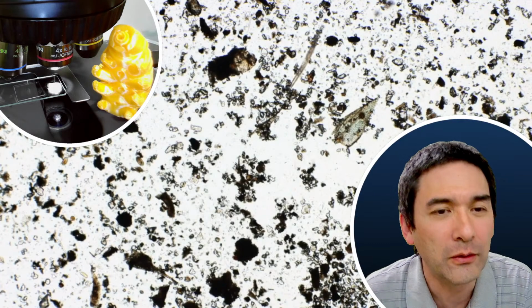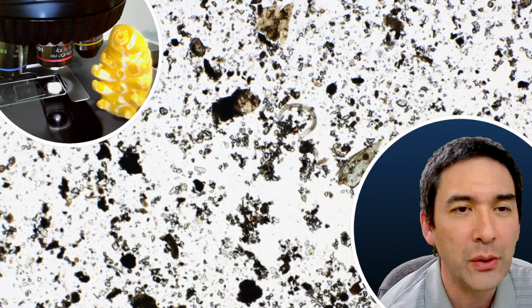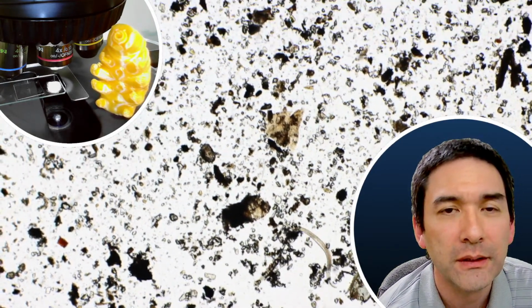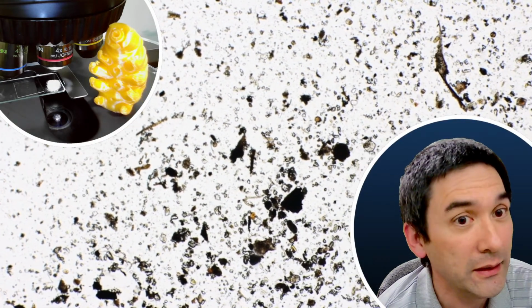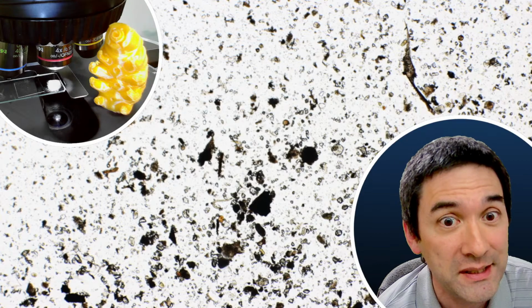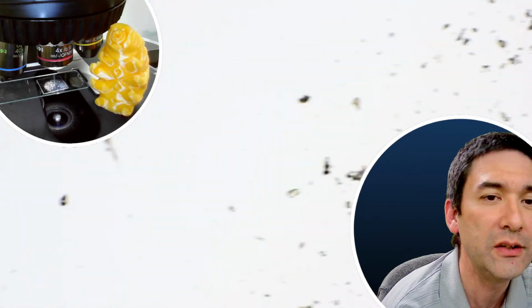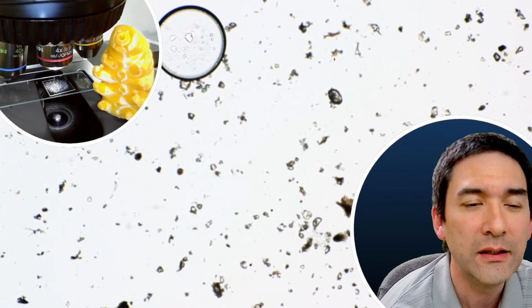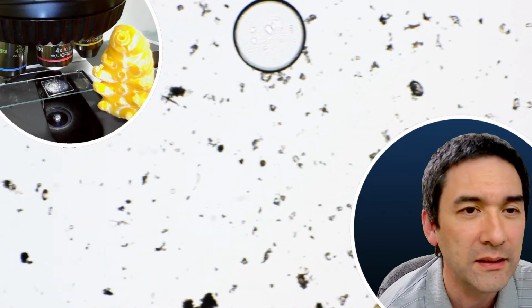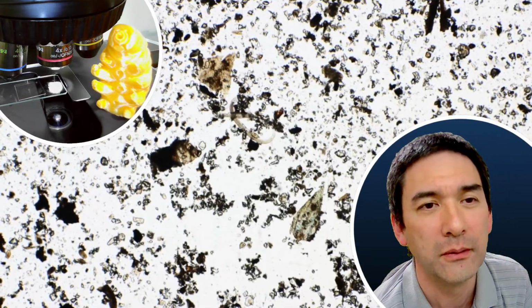So what I've got over here is a sample from a moss. I will show you then also how I've collected the sample, and I have to tell you, I'm really very upset with myself because I really had this very nice tardigrade here under the microscope slide, really nice, and then it continued to walk off, and I basically did not pay attention for a couple of minutes, and then it was gone. So we have to be a little bit lucky today.